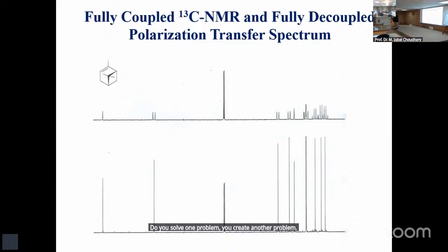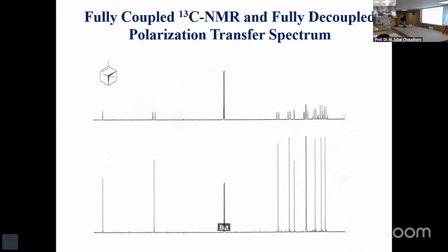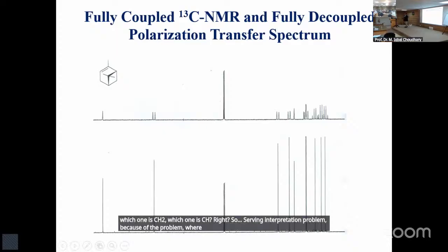You now see nice signals, and the chemical shift is so obvious, but you don't know the multiplicity.